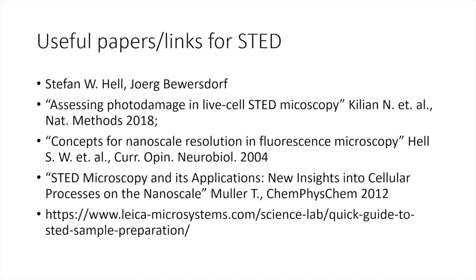The first paper shows live cell STED microscopy, how they assess the photodamage, and how to minimize the cell damage. The second and third papers are about the concepts of STED. If you are interested, you can take a look, or we can discuss after this session.